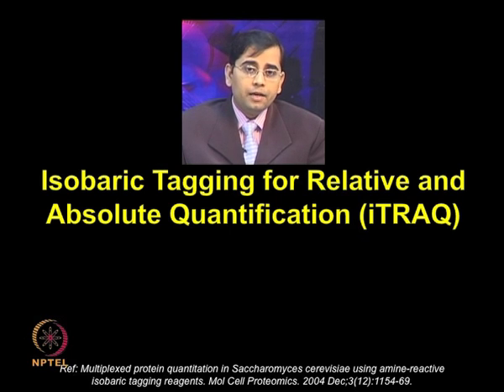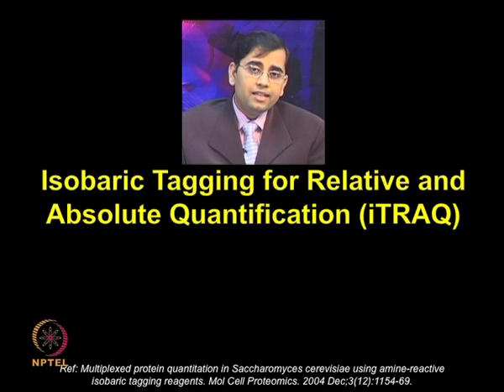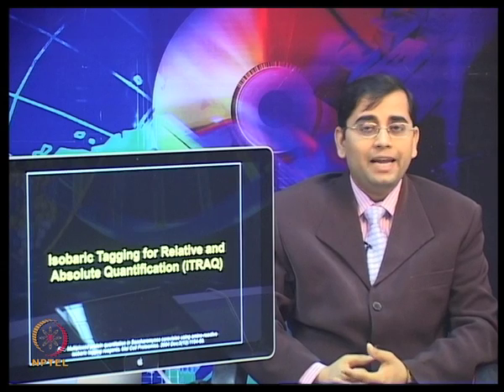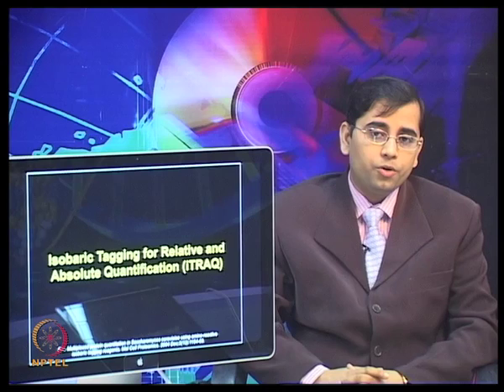And these labels can be provided in the proteins via their N-terminal. The iTRAQ labels from the Applied Biosystems and tandem mass tags labels from Thermo Fisher are currently the only commercially available tagging technologies where quantitation is carried out in MS-MS mode.